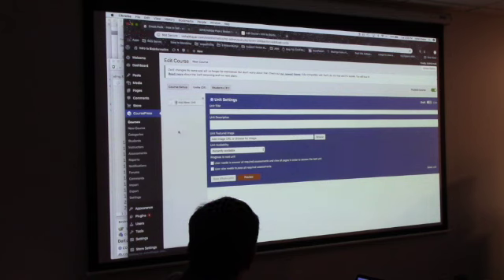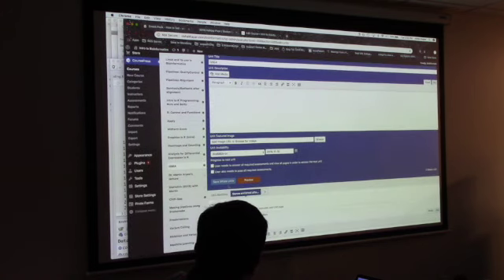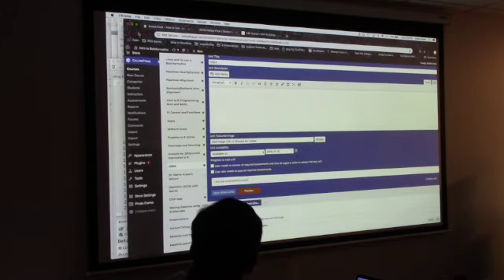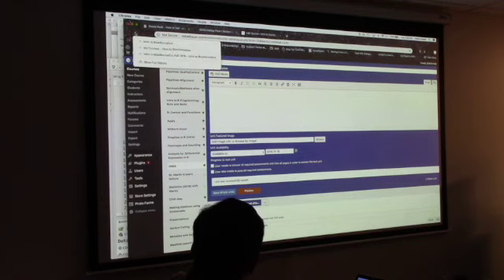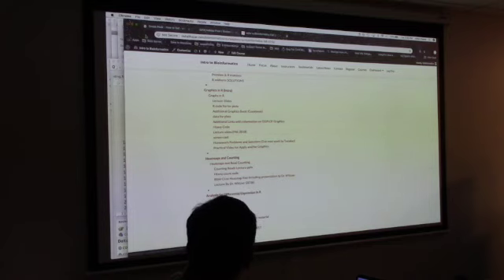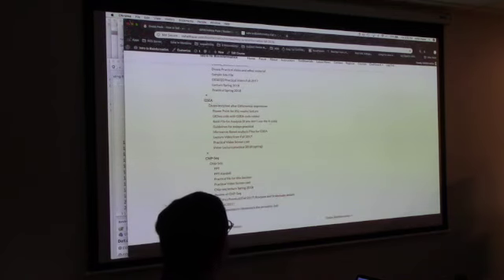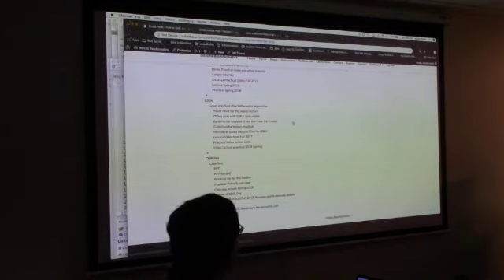But basically, once it is available, which should be right about now, go back. Okay. So you'll be able to see GSEA here. Now what you're going to do is you're going to look at these, go over here, click this. There are a couple of things you'll need to download, and that includes this rank file for your analysis.